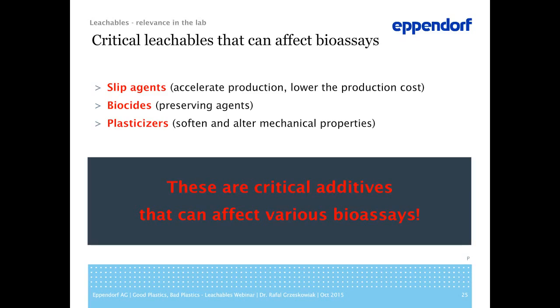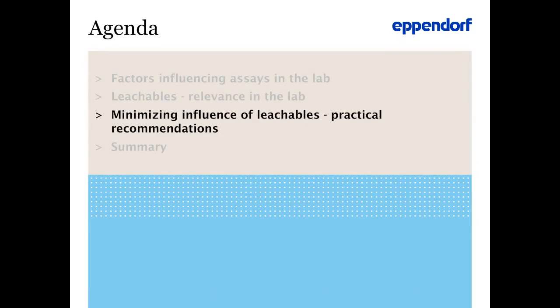All right, thanks again. Well, let's say, again, from our perspective, interesting results. It indicates really that most of you actually have problems, and these are related to consumables. Some of you, 6.5%, even very often. So I hope this seminar will basically provide you vital information on how to deal with this. And this is actually the next chapter we're going to now. Thanks again for participation in the poll. And so let's go to the final point of this seminar, minimizing influence of leachables, practical recommendations.